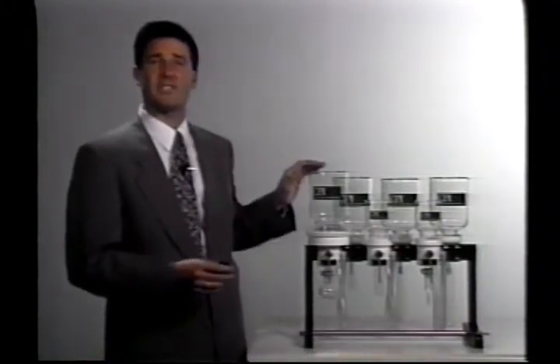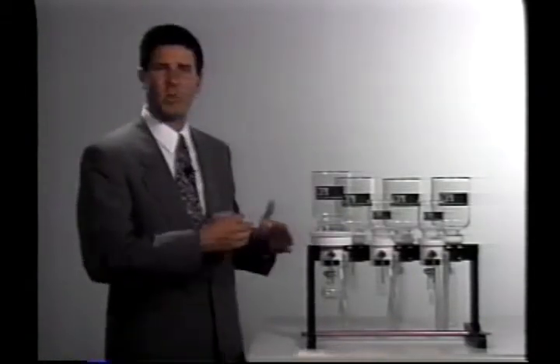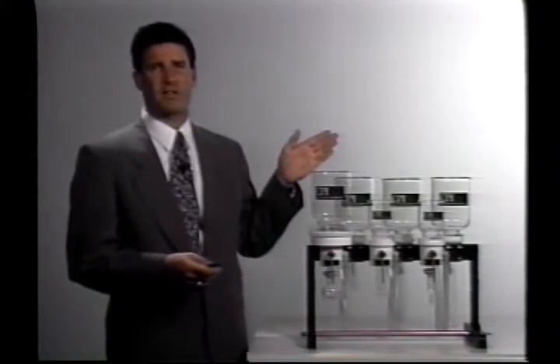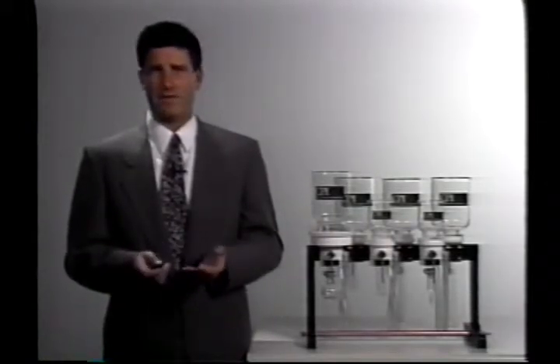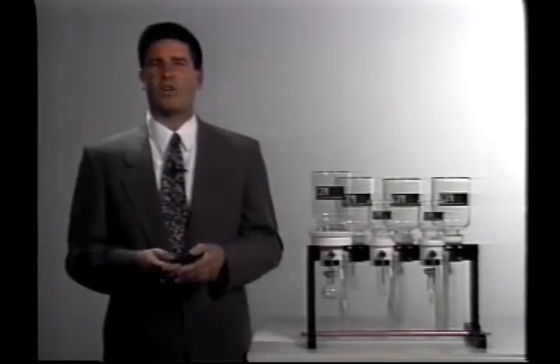CPI produced the MultiPrep 7000 to be a very compact unit so that it won't take up much space underneath your fume hood. Its dimensions are nineteen and a half inches long, ten inches wide, and depending on your sample reservoirs, up to nineteen inches tall. Besides being very efficient and compact in size, the manifold is extremely sturdy. Its specially designed base evenly distributes weight to prevent tip over — even with three full liters of water in the front three positions, it won't be prone to tipping in any way. This manifold is also extremely durable and very inert; your sample will only come in contact with either 316 stainless steel or Teflon. This will prevent any contamination or carryover, and it will also prevent the manifold from being attacked and degraded by your sample matrix.